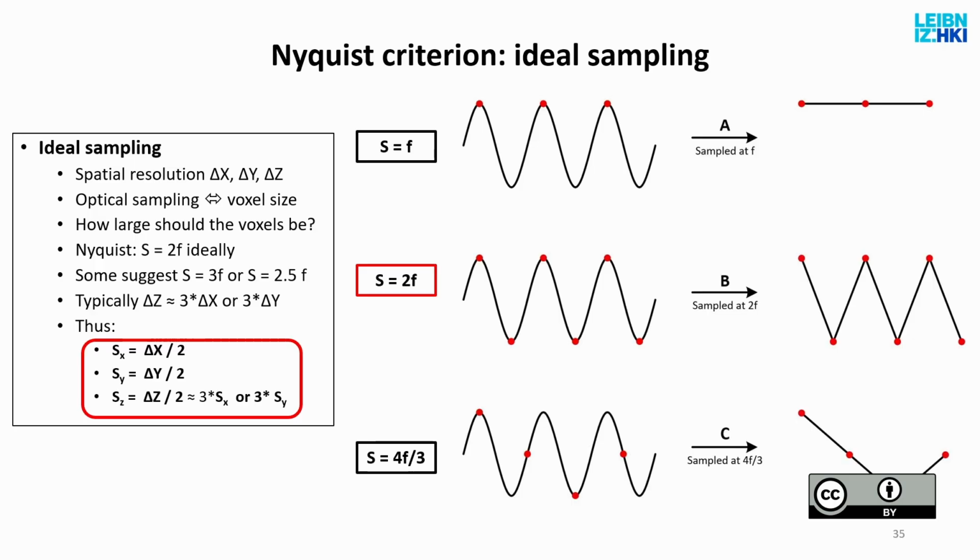If your microscope is not capable of that, because let's say it's a camera-based one and you simply don't have the camera chip good enough to have such small pixels, then you cannot take advantage of the resolution of the microscope. So optically it works, digitally it doesn't. The principle is called the Nyquist criterion, and it basically says what I just mentioned.